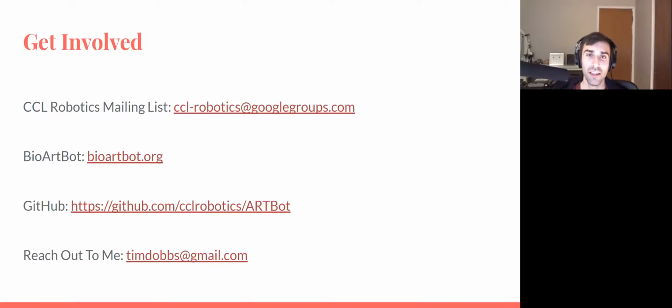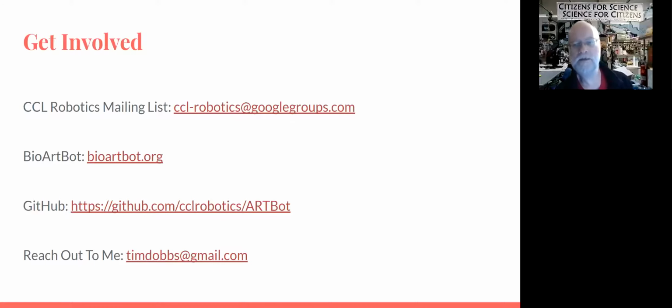I don't know the exact answer to that, which sounds like a really fun experiment, actually, and is exactly the kind of experiment that I'm really hoping to encourage people who want to learn from the platform, because it should be pretty easy to do to figure that out, right? So we actually found that with the E. coli strains we were working with, we were able to blend them fairly well because they were all the same E. coli strain background. The only thing differing was which chromogenic protein they had. So they all grow nicely at the same rate and stuff like that.